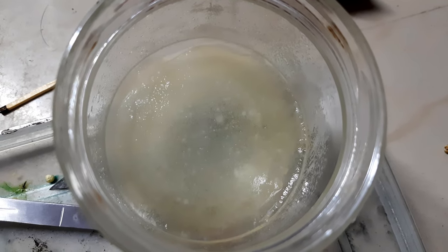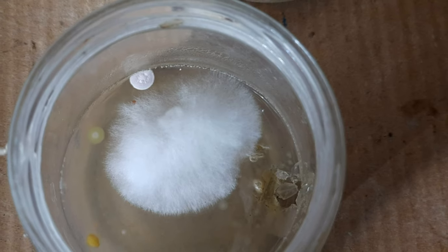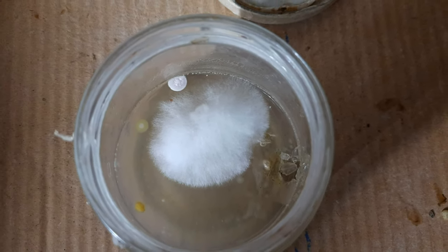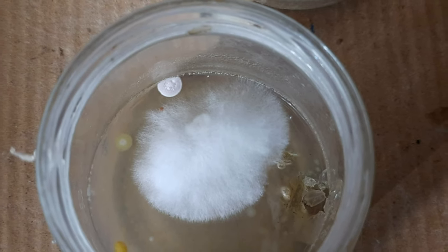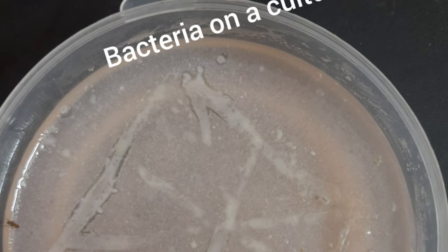I know this is a weird sample, and I'll show you more in the future. This is a small contaminated sample showing fluffy mycelium of some mushroom mixed with some bacteria — a yellow colony — as well as a circular round structure which is some other fungi.